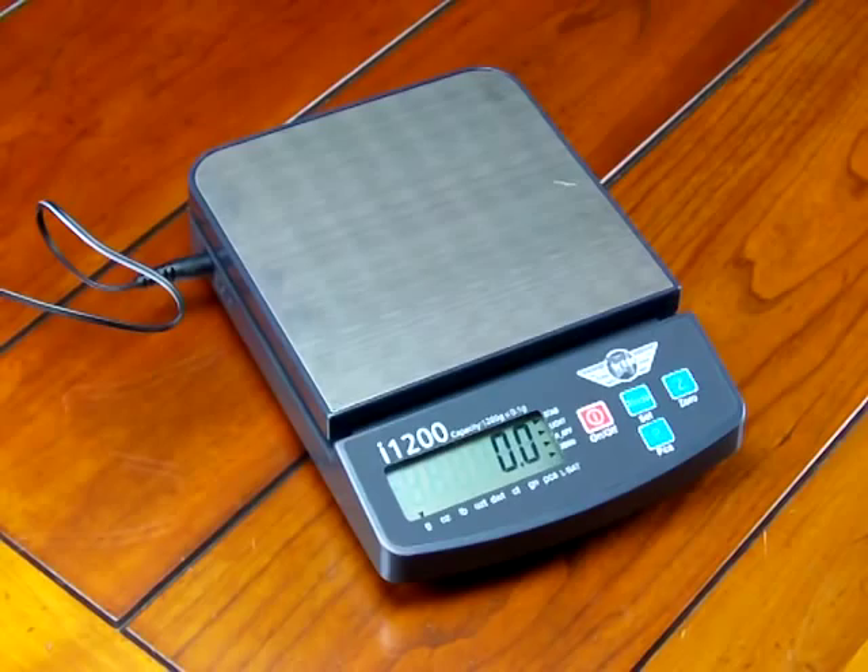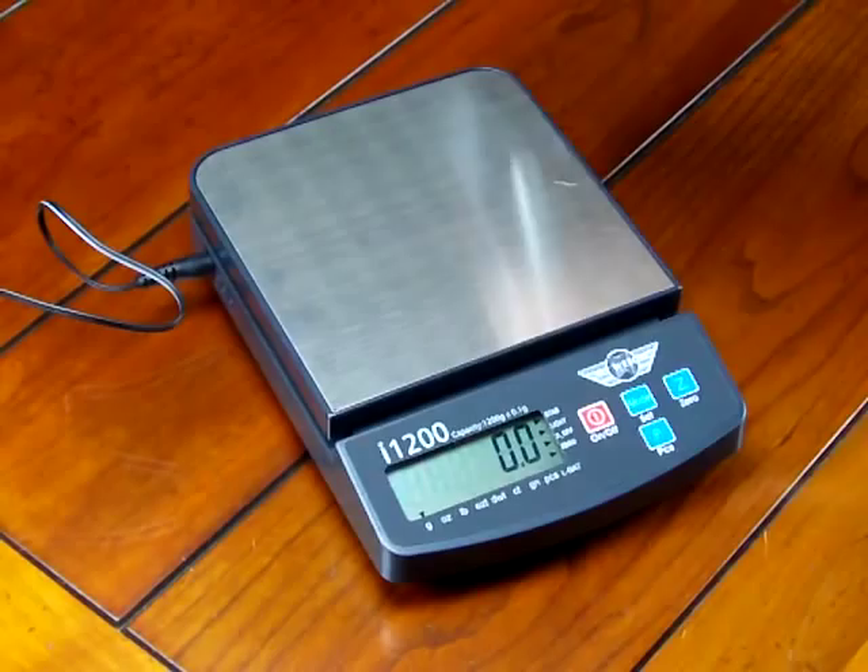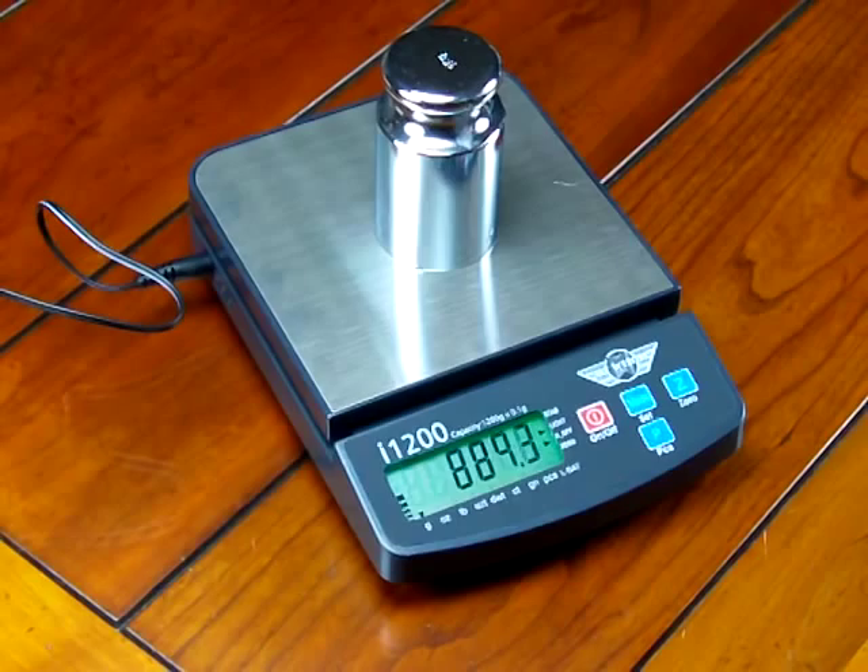So let's walk through how to do the calibration. I've turned this scale on — it's been on for about 10 minutes. This is a 1000 gram calibration weight, and we'll put it on and we'll see that the scale reads 1000.7. So it's off by 7 divisions.